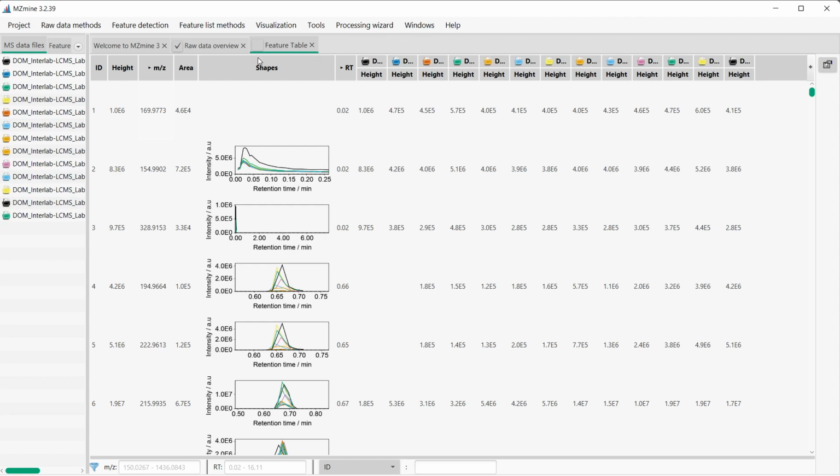So we're saying that for a feature list, we have to understand that a row is a feature list row, from the data structures in MZmine. We have the feature list, we have a feature list row, and then for each sample, we have a feature. A row makes up multiple samples, so multiple features, and then we have the average values that are constructed from all the samples. So we have the m/z, retention time, and so on as the average, and then we have the MS2 fragmentation spectra that come from different samples. We also collect them into a list for the feature list row.